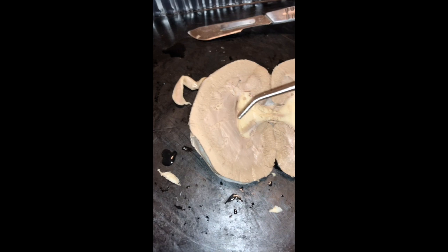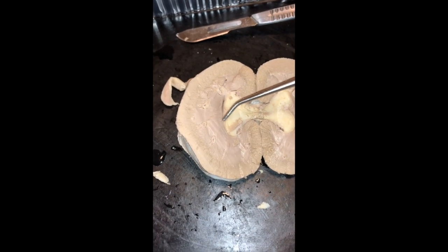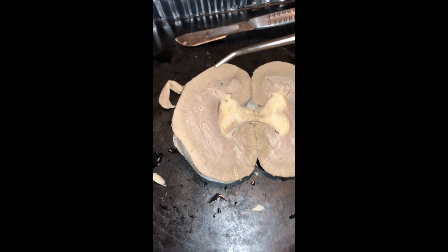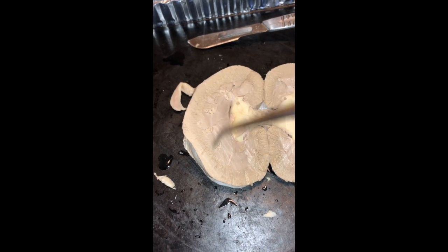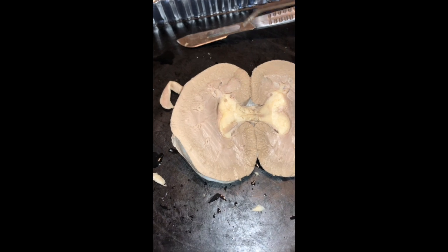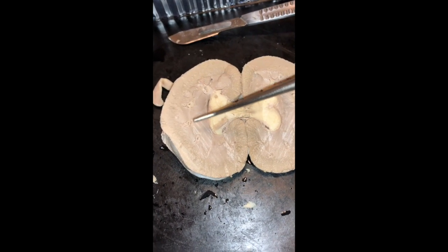we have the pyramids, which run like this, with the apex down here, base up here. And in the medulla are also the calyxes, which are these little cups. Okay, and then we move into the pelvis, but there's also the papilla within the pyramids as well.